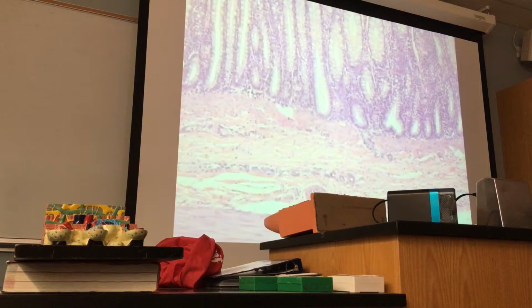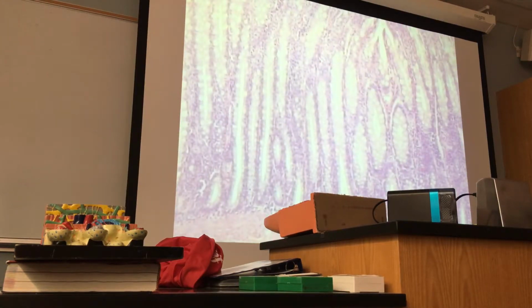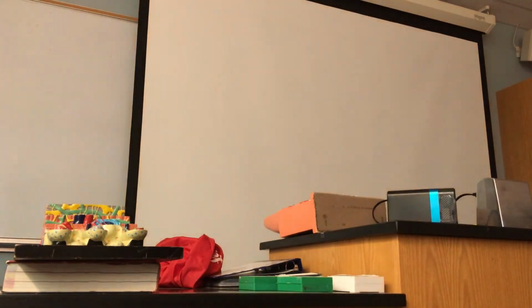Look here. You see hundreds and thousands of goblet cells. The goblet cells are stained very lightly. Can you see this? These are all goblet cells, but in between goblet cells are the absorptive cells. So you will see much better under even higher magnification.